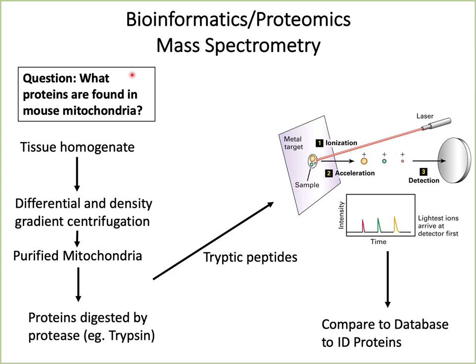Now, you do have the sequences of the proteins from the database. Almost all sequences of these are known. Say, for example, if it is a human being, the human genome is already sequenced. So basically what you can have from here is a mass, which maps to a protein sequence.